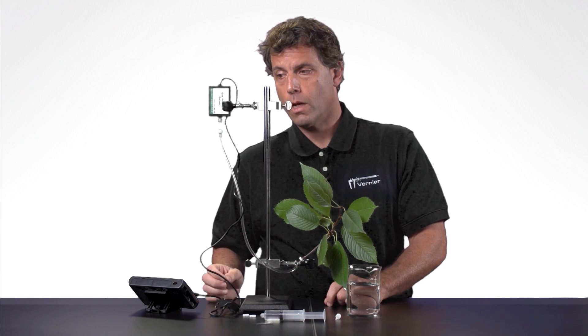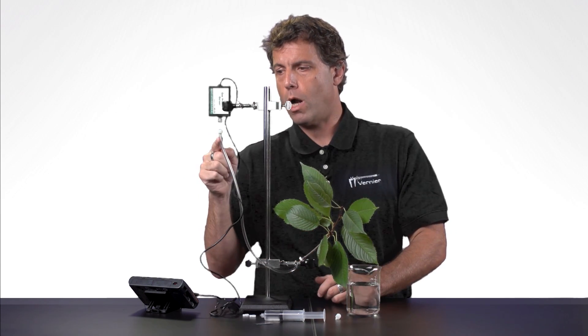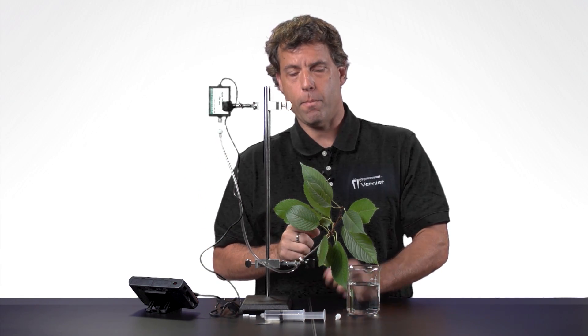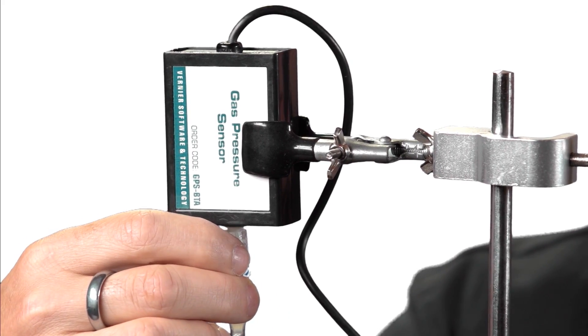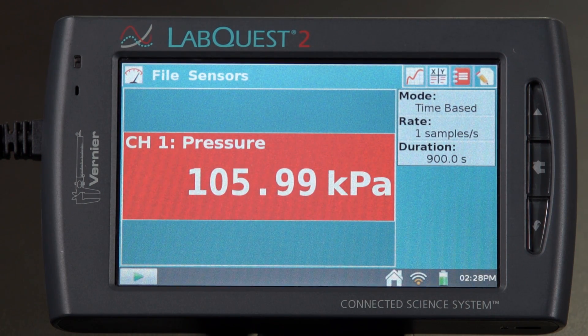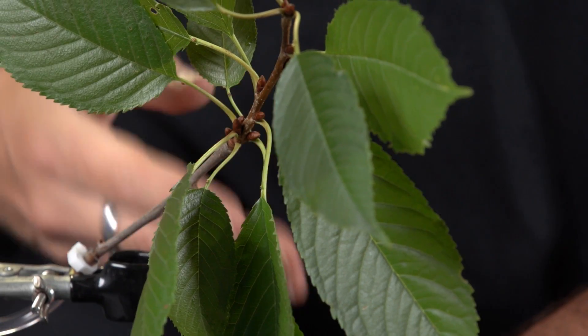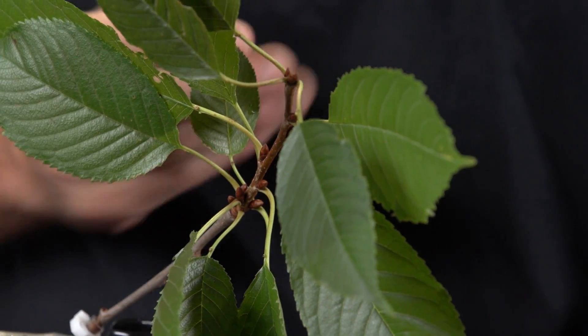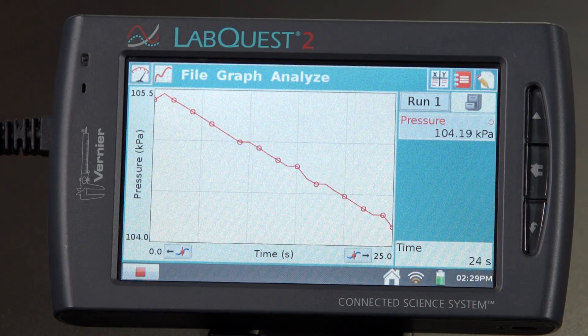Now we're ready to begin the experiment. Once I open this valve, the leaves will begin to transpire — water will be pulled from this column up the stem and released out through the leaves. That means the pressure should drop as a function of time. I'm going to open the valve, and you can see that the pressure drops a little bit. We can see that the pressure is decreasing. To show you clearly, I'll auto scale the graph — click on graph, auto scale once — and there you can see the graph is decreasing. Transpiration is happening.